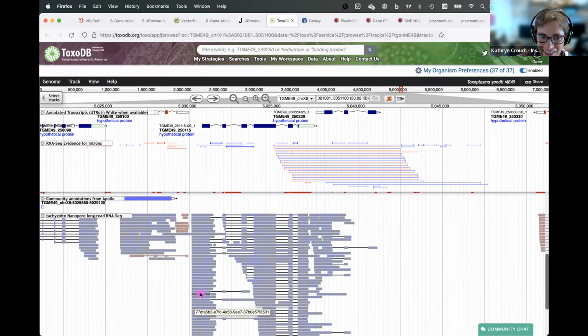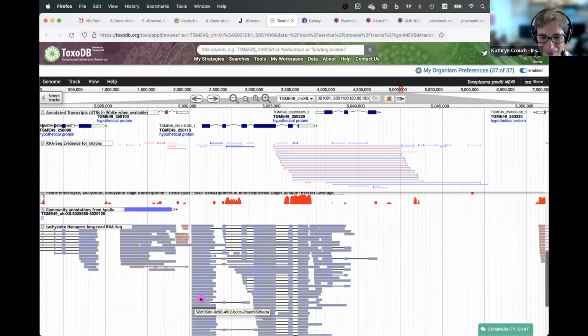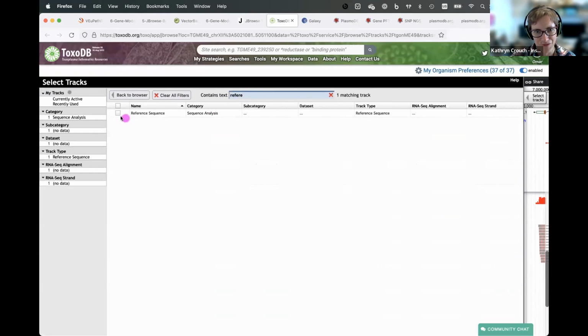Yeah, that's really unusual for this data set. It's normally the 3' end that looks good and the 5' end that looks really messy. So I think that may be what's happened here. If that's the case, it can actually be helpful because it does tell you stuff about the 5' end, but that gap in the middle, I don't really trust.